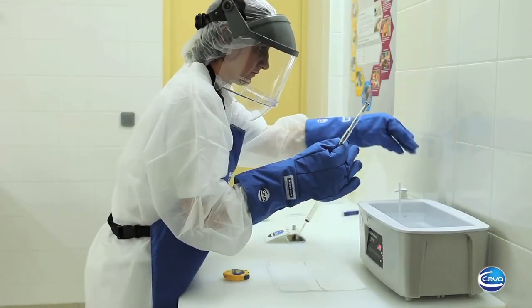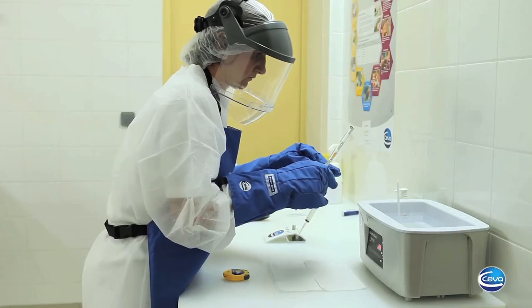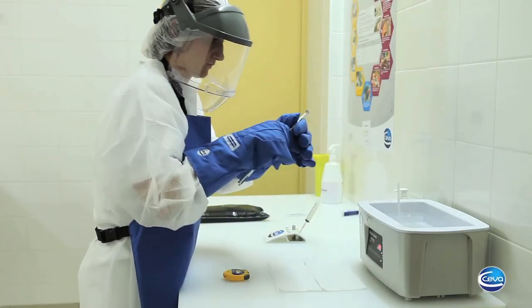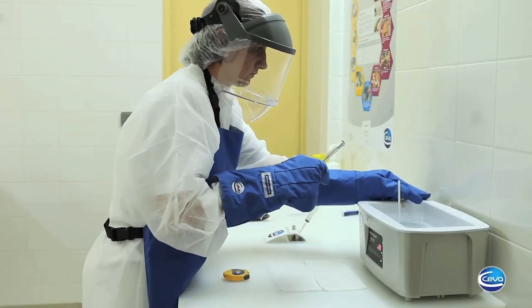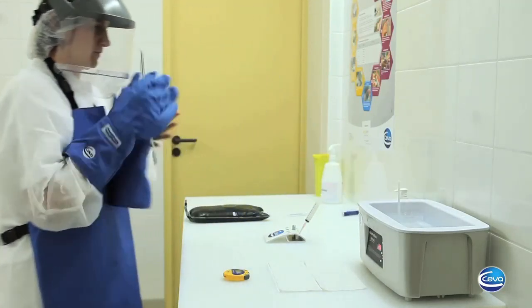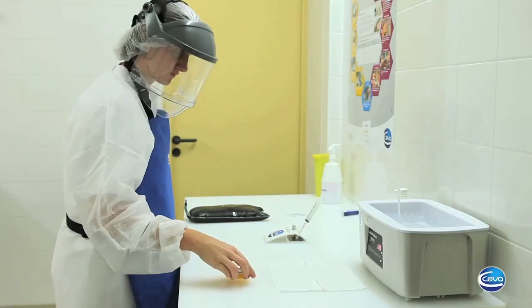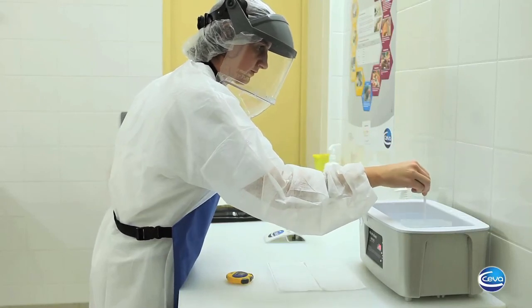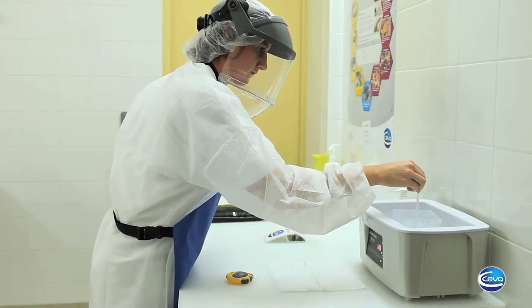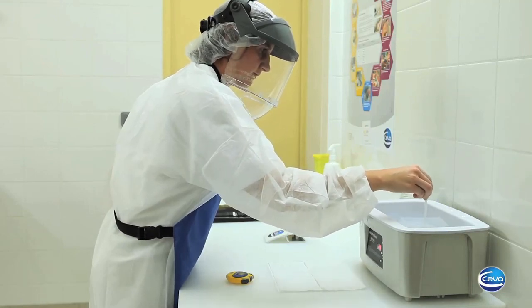The water temperature should be maintained between 26 and 28 degrees Celsius. Refer to the thaw bath thermometer as a reference or use your own. Preferably use distilled water. Remember that the thaw bath should be cleaned and disinfected every day. Thaw a maximum of 4 ampules at any time. Hold the ampules together and make circular movements. Try using the whole area of the thaw bath in order to fully thaw the vaccine.